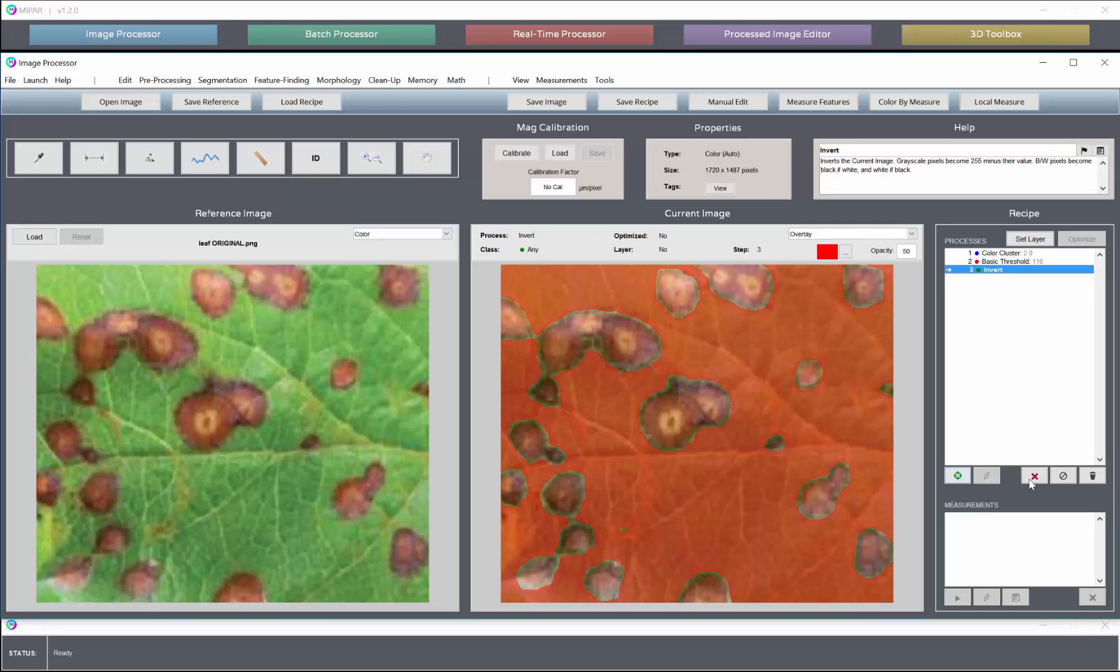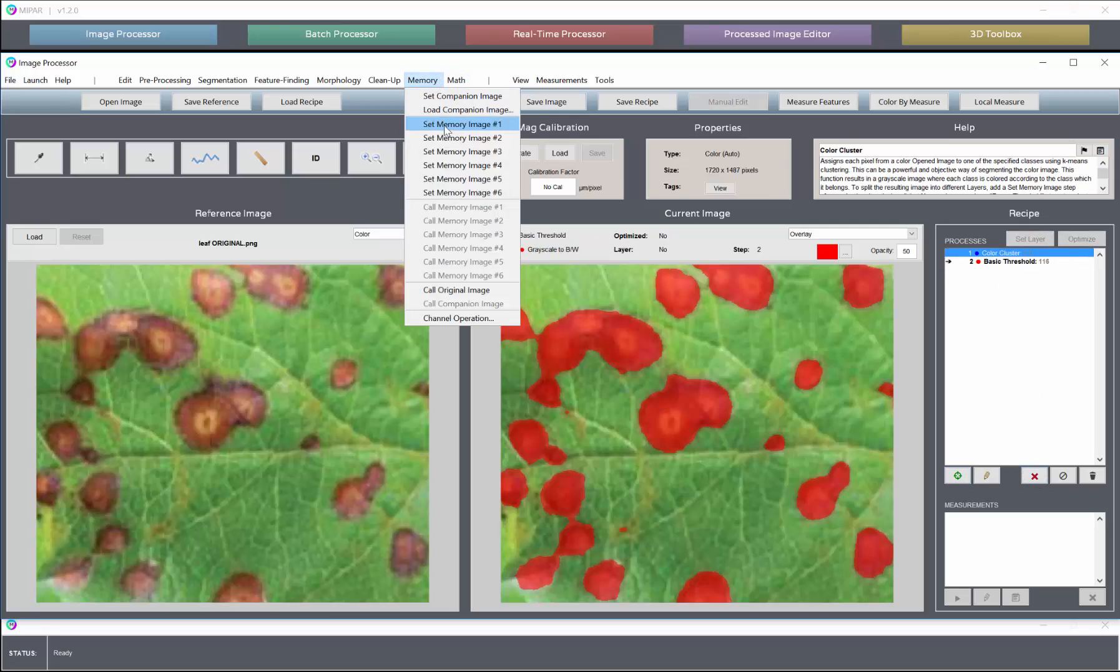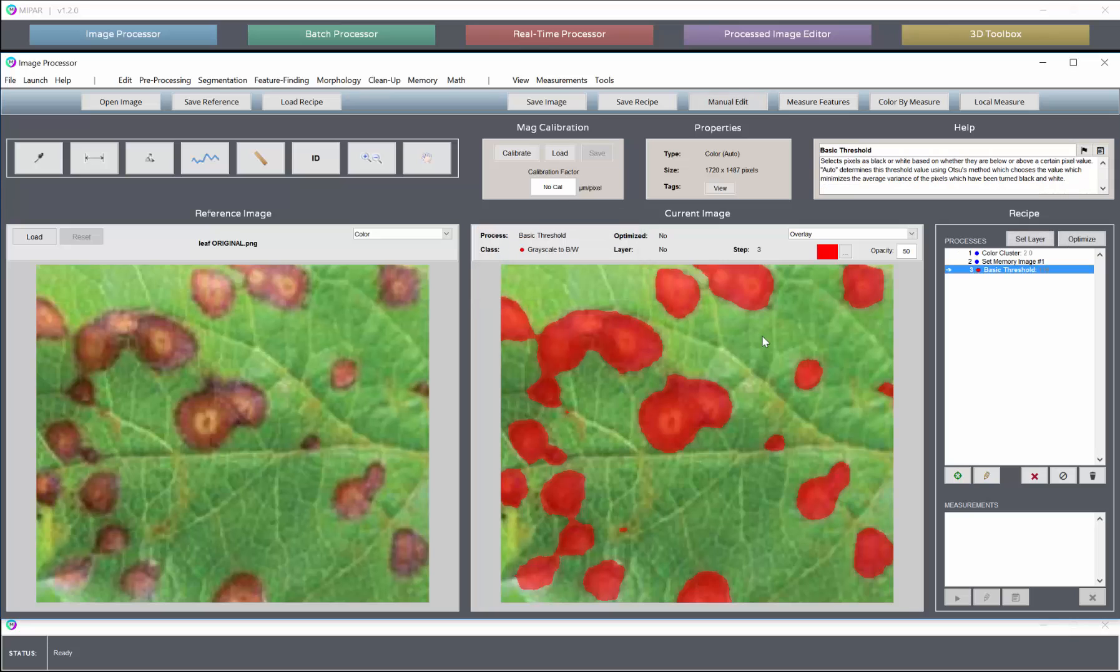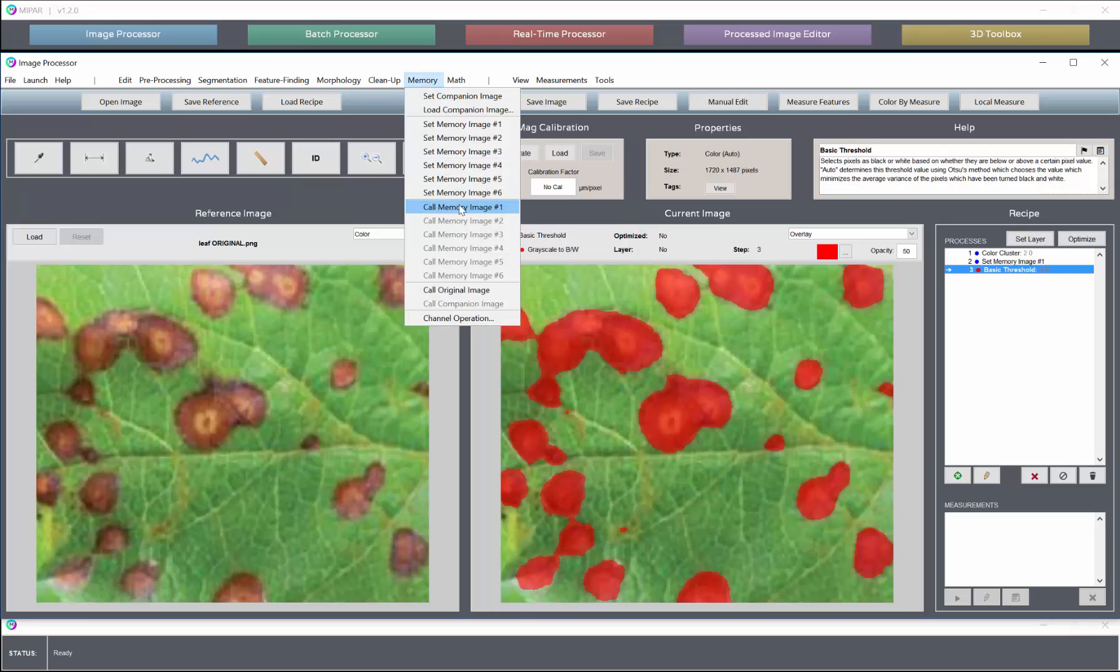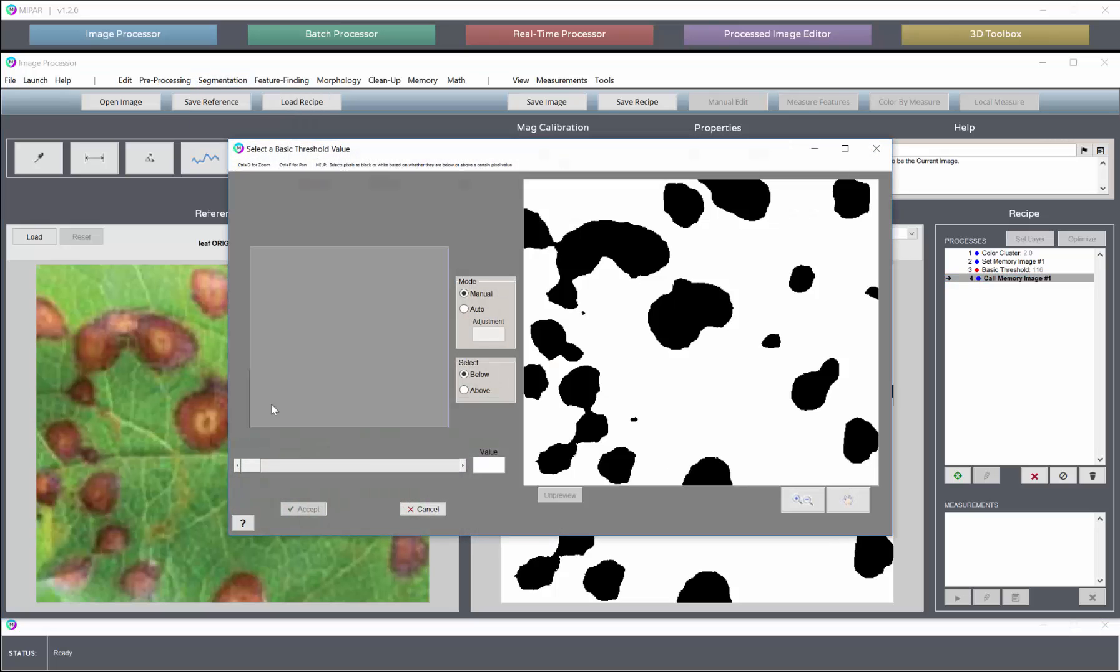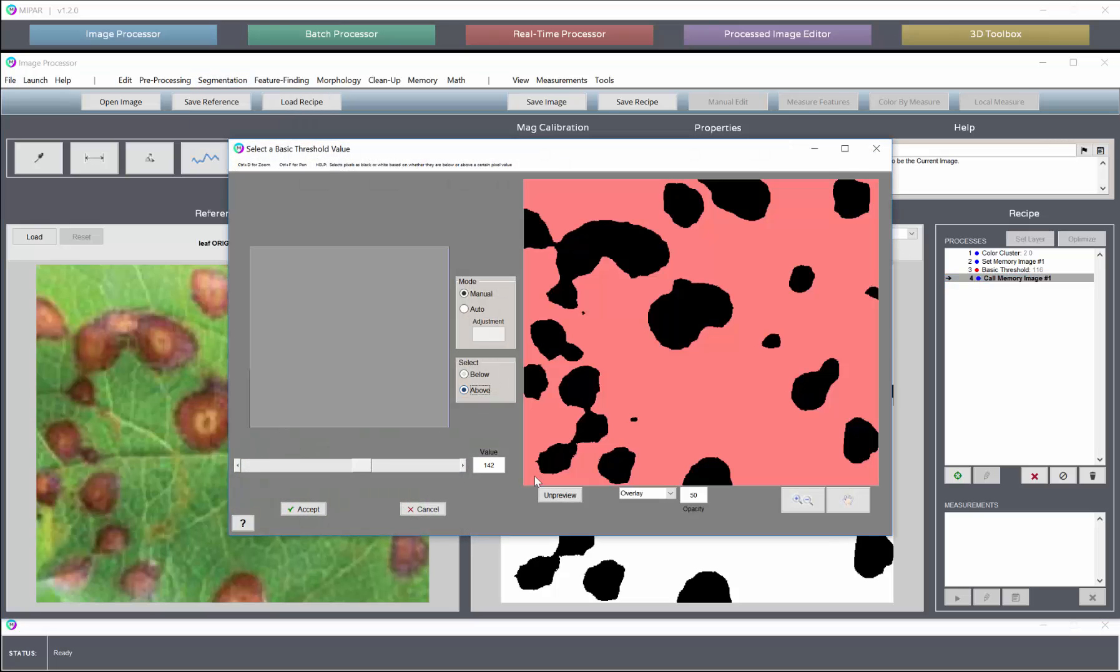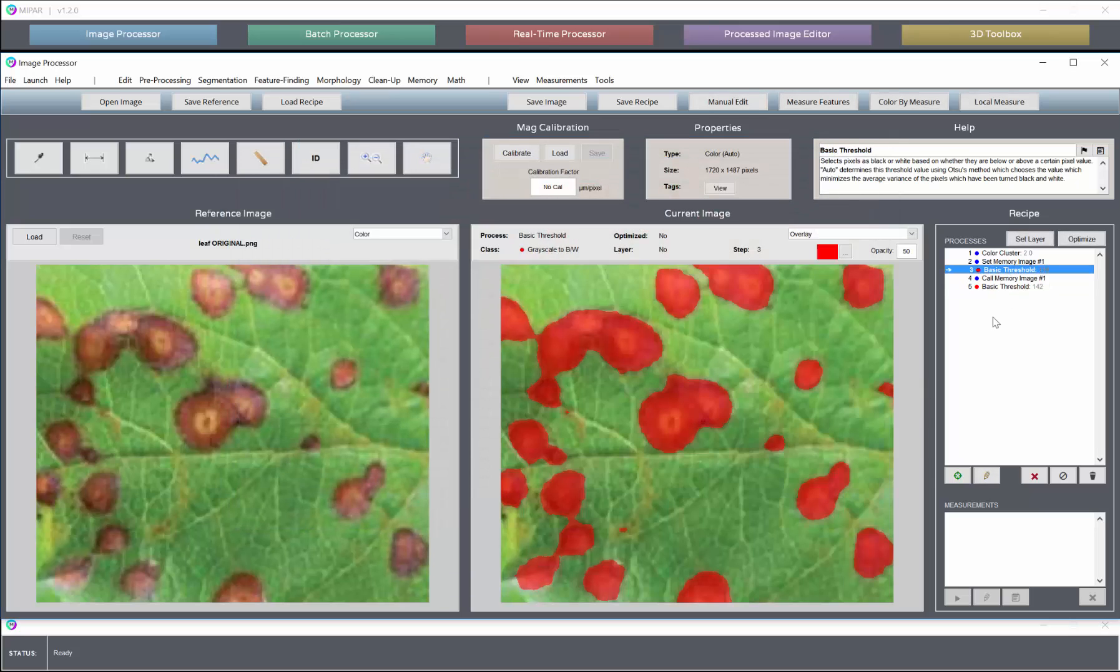Or we could set that as a memory step and call it here, and then choose above our threshold value to select the other class.